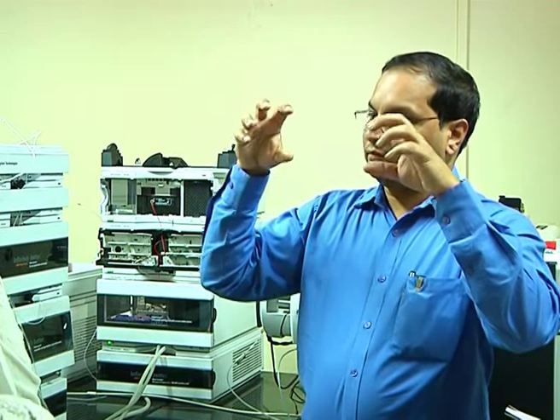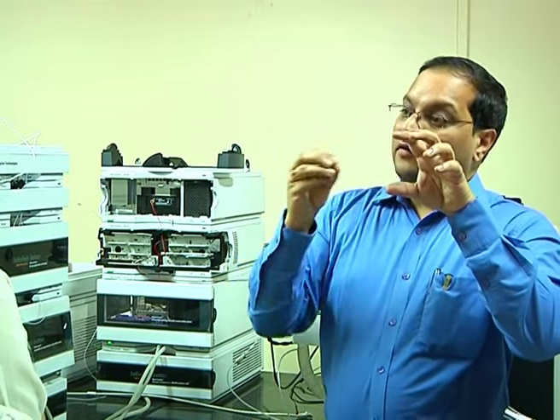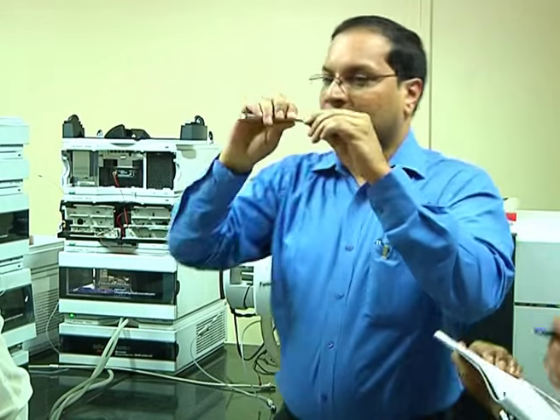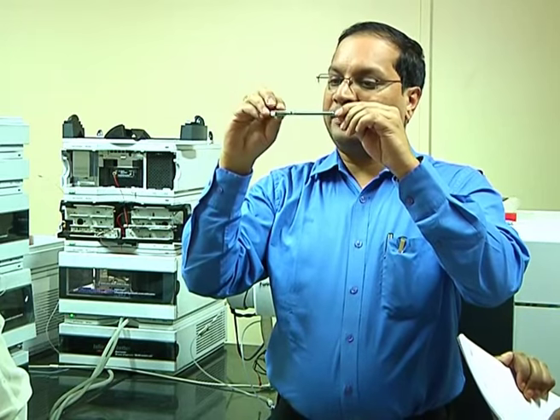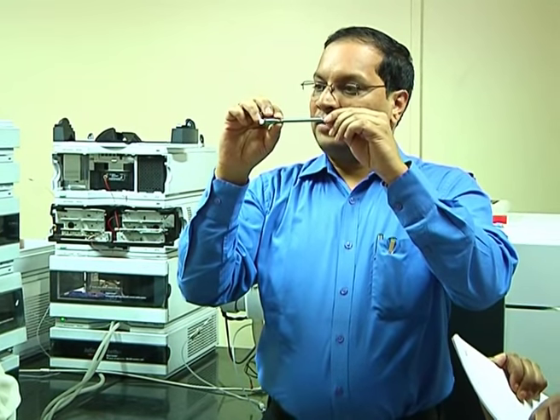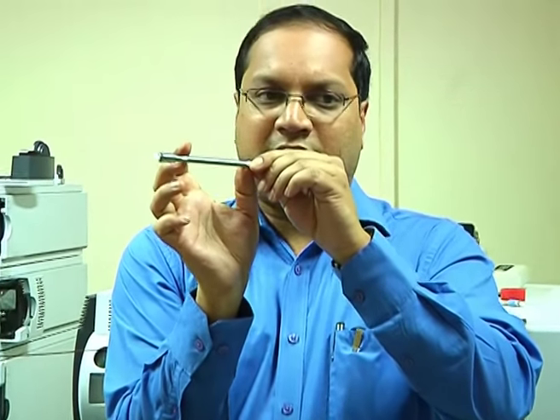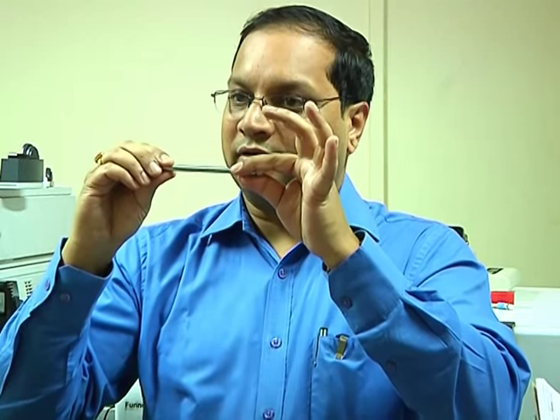Broadly, the pumps will pump the mobile phase, where A is water, let us say. While loading the sample, we use more aqueous, so that your peptides get retained on the column, the stationary phase. If this is my stationary phase, depending upon hydrophobicity, of 10,000 peptides, a few will bind here, a few will bind there, and they'll get spread across the column based on their hydrophobicity, and they'll get retained.